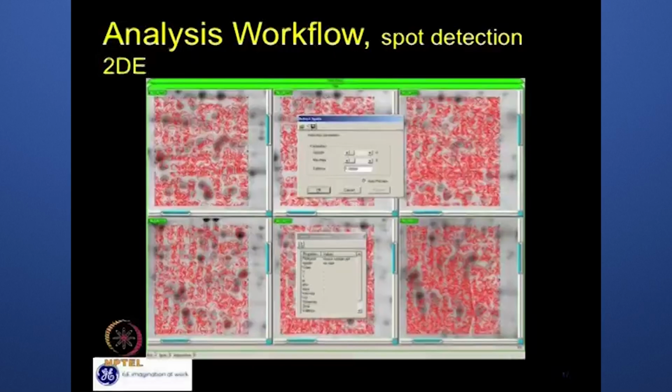So these numbers will be, I guess, more clear when we look at a demo of the software. Exactly. When you change the numbers, you can see the real output easily. During spot detection, you can see on the screen whether it is over-splitting, or optimally splitting, and you can decide whether these parameters are okay or not. These red boundaries are software generated, and these are the parameters we are talking about: smoothness, saliency, and minimal area.